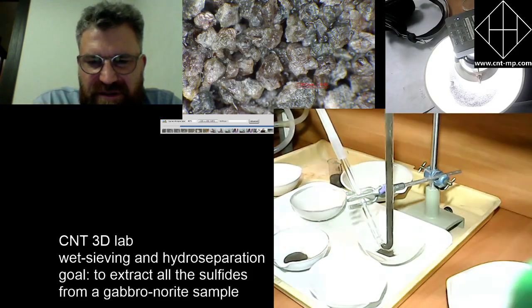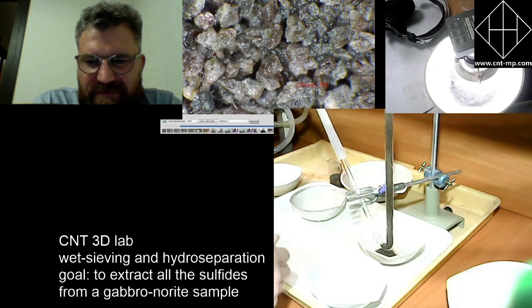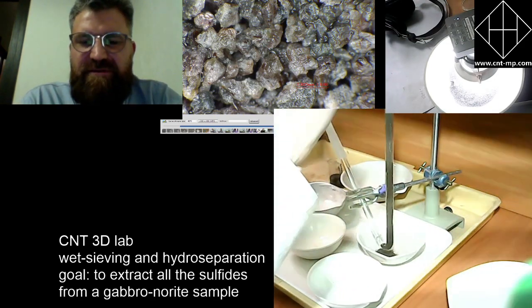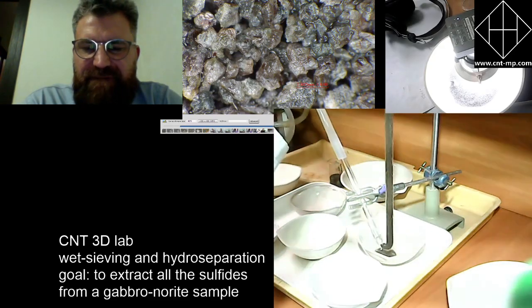Here you are. Somehow it's not visible. Not easy to see, I don't know why.